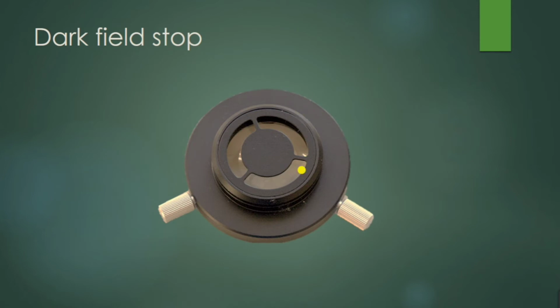And this is the picture of a dark field stop that you keep below the condenser to focus the light. Here you can see some holes in this. The light will be scattered and will come through these holes to enter the specimen that you have kept on your slide.